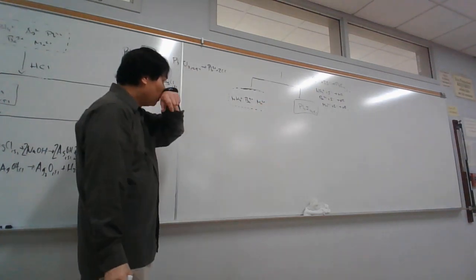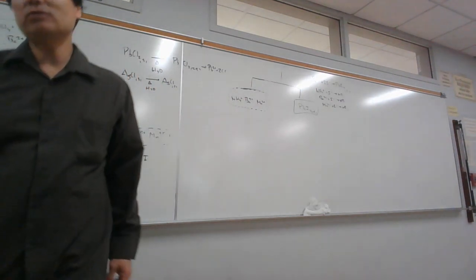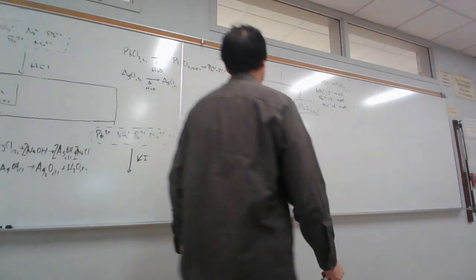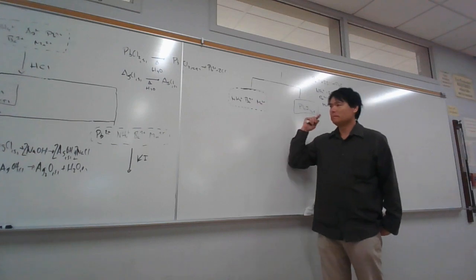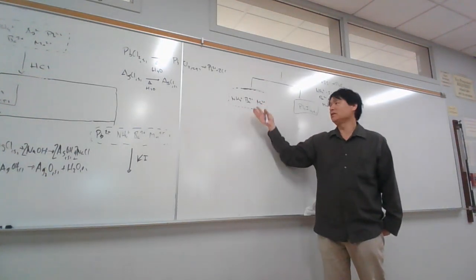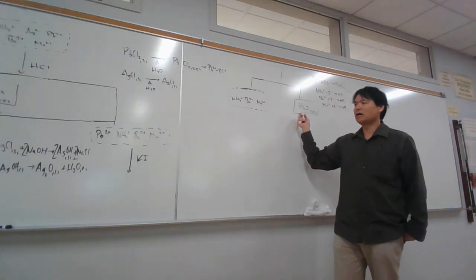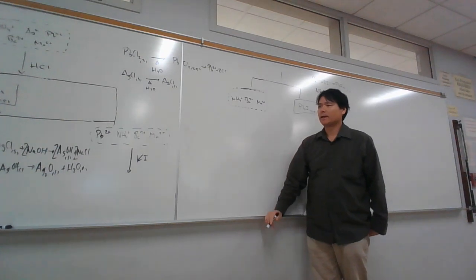Okay, same thing holds here. Make sure we precipitate out all. And so to make sure we precipitate out, sometimes we'll just test it one more time. Yeah, we filtered this, but just to be sure I got all the lead out, I'm going to add 1 drop of potassium iodide to this and see if I get precipitate. If I continue to get a precipitate here, then I wasn't done. Filtering is kind of nice because after you filter it, this filtrate should be nice and clear.